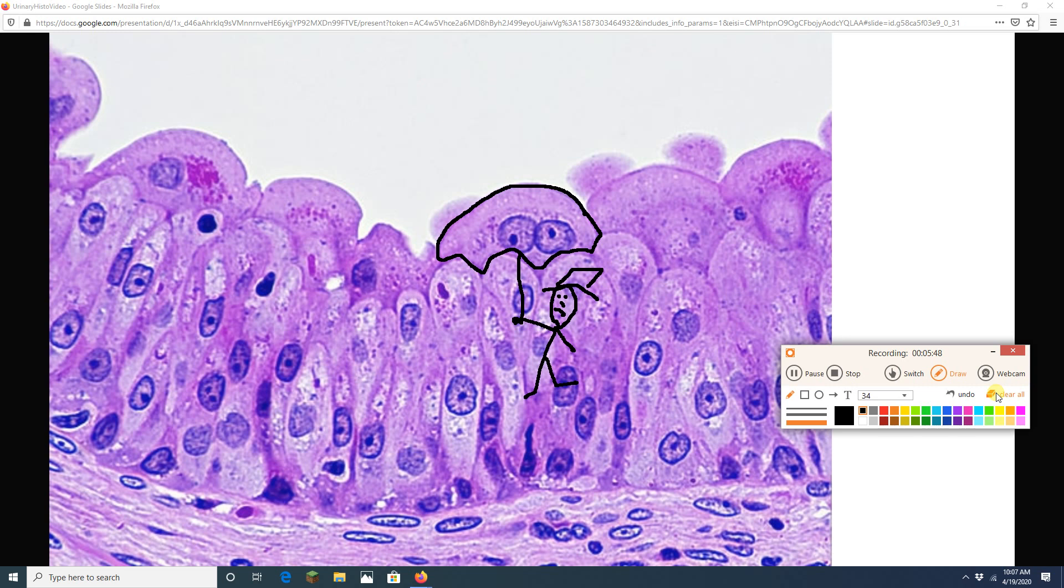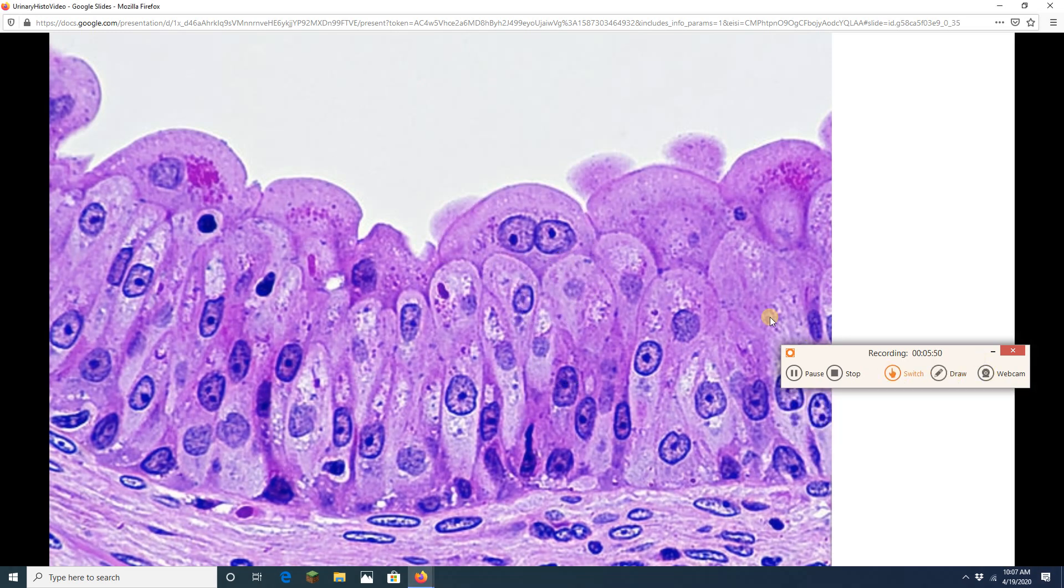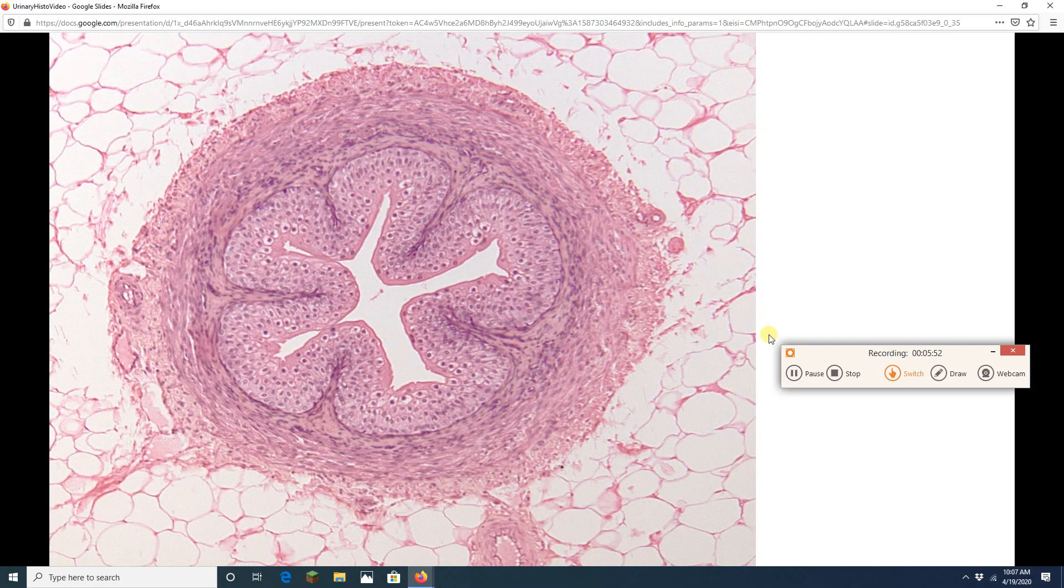All right. I hate to do this but there we go. Let's keep on going. Because we're done with the urinary bladder. This is a ureter.